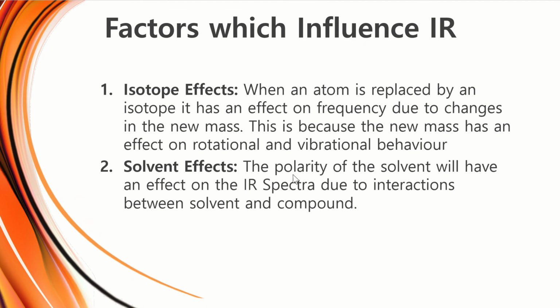Solvent effects. Well, the polarity of the solvent will have an effect on the IR spectra due to interactions between solvent and compound. So when you're reporting IR data, you will definitely quote the solvent, right? Because the solvent would interact with the IR or influence the IR. So you generally report the solvent if you have used solvent along with the data.